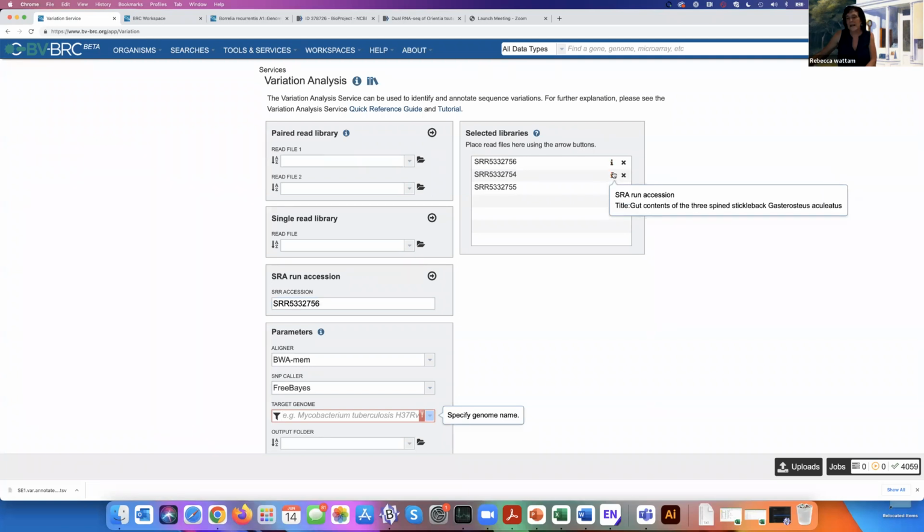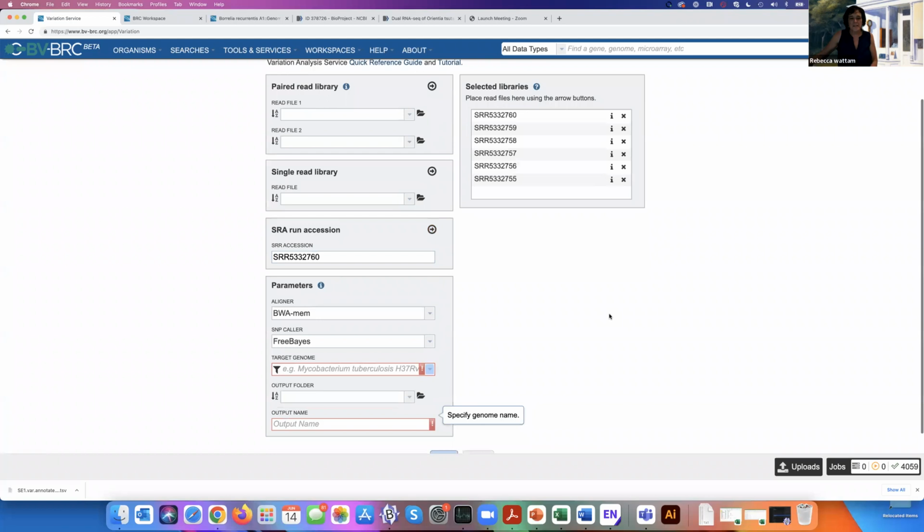You see this? I was going in the wrong direction, and this is a different species. I don't want that, so I just click on this. So I've taught myself an important lesson, and you're seeing it too. I knew that this went up, so it's always good to check. So we're still at Borrelia recurrentis. Well, actually that's not 8, 9, this is 6. So yeah, we've got all the strains here, all 6 strains.